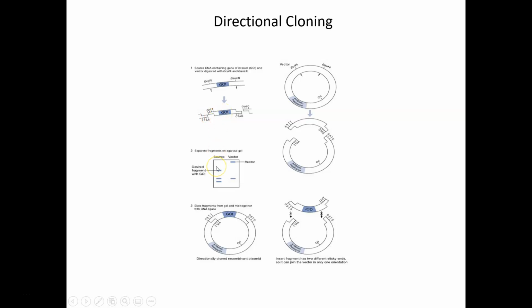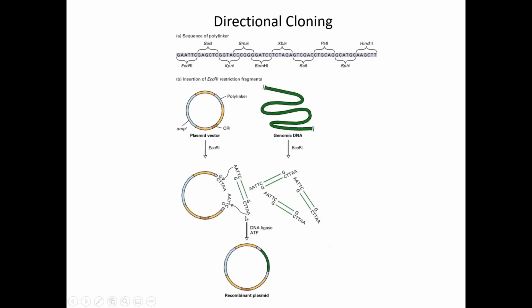And these two little scrap pieces are the two side nubs that we've cut off as scraps from our gene of interest. So we would physically get a razor blade, we would run this gel, visualize it on a UV light box, and we would physically cut this band out of the gel with a razor blade. We would melt the gel down, liberate the DNA, capture the DNA based on its negative charge, and then once we isolate that DNA, we would mix it together in a single tube. Our gene of interest would anneal into the sticky ends that it is meant to in the plasmid, and we would add a little bit of DNA ligase to make those new phosphodiester bonds and create a whole entire plasmid, a recombinant plasmid.